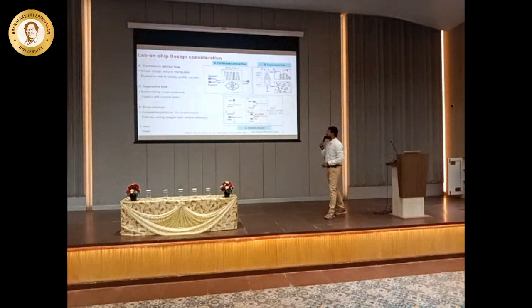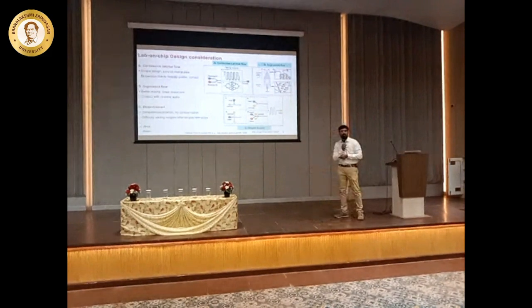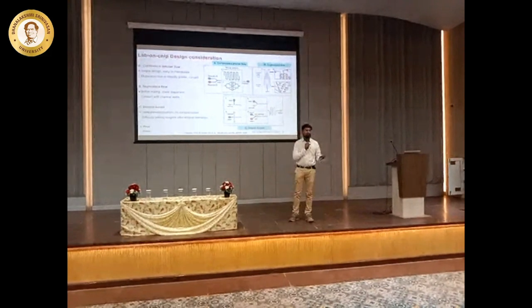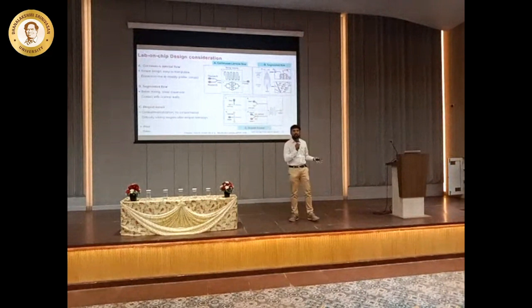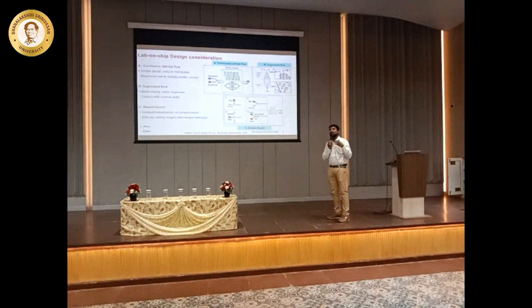So these are the three different parameters that we can see. One is continuous laminar flow, another is segmented laminar flow, another is droplet-based laminar flow. The pros and cons are of each of these microfluidic devices or designs that we use. Continuous flow is generally used for polymeric nanostructures. So if you want to make some polymers, like chitin nanoparticles, PLA nanoparticles, PLGA, because all these nanoparticles have very good applications in drug delivery, right? So if you use continuous laminar flow, you can create polymer structures.